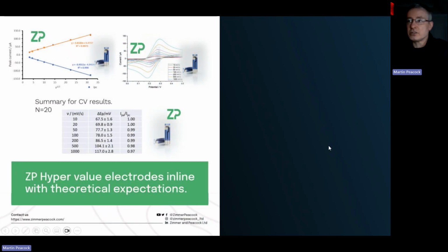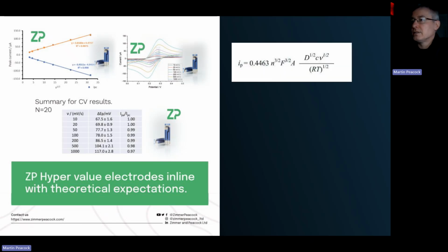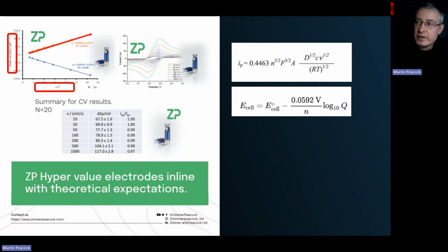And then the other thing on quality is people are looking at screen printed electrodes and sort of thinking of them like glassy carbon electrodes, and so they want to characterize them by the Randles-Sevcik equation, or they might want to characterize them by their Nernstian behavior. But when you're talking about translating academic research to real world people, like people measuring caffeine or people measuring capsaicin, they don't care about the Randles-Sevcik equation, and they don't care about the Nernstian behavior.